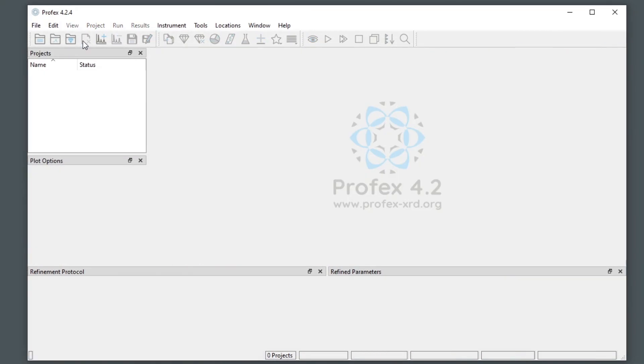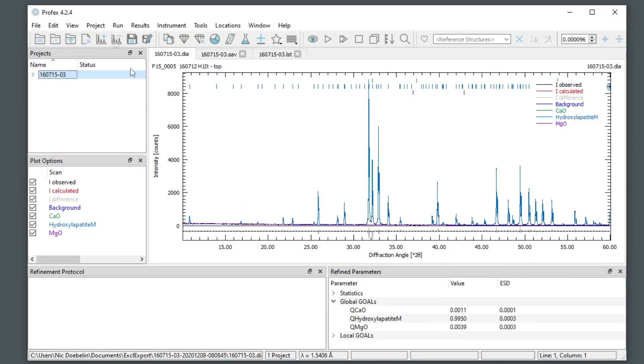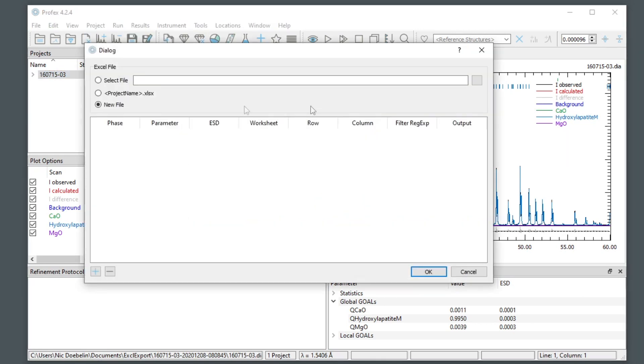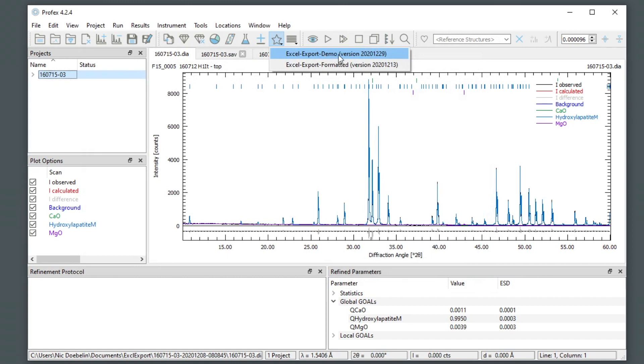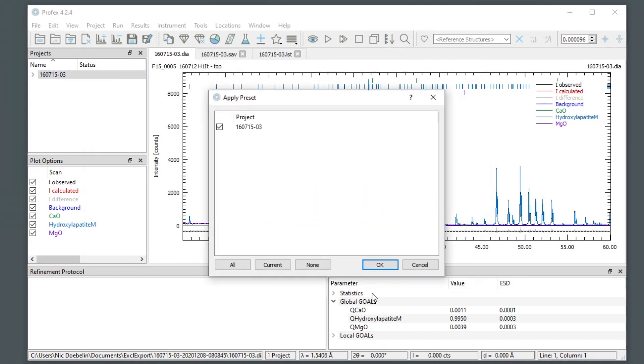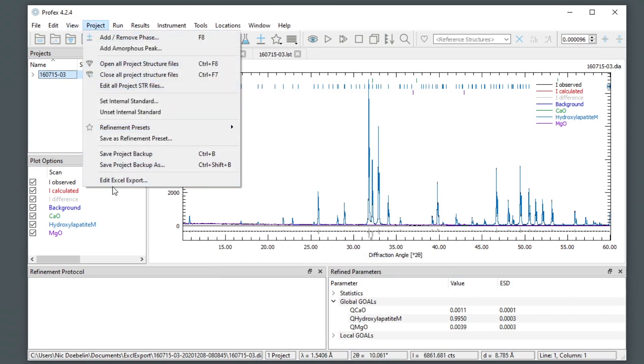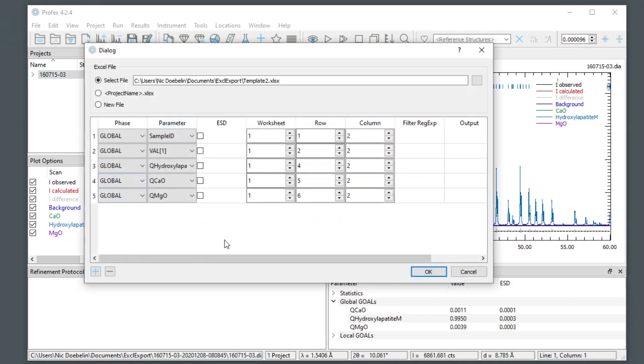So if I close this project and open it again, I go to the edit Excel export and as I said, it's empty. All the information we set up before is lost. But what we'd have to do is we have to apply this new preset we created. We can apply it to multiple projects at a time. And if we have a look at the export configuration, now it is restored again.